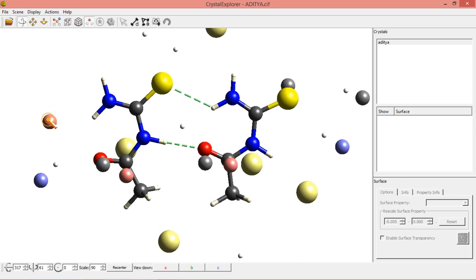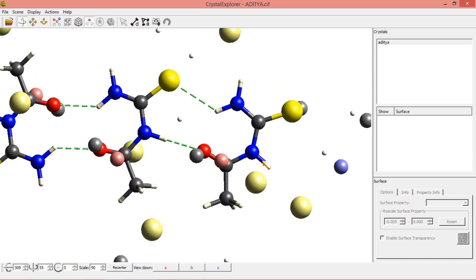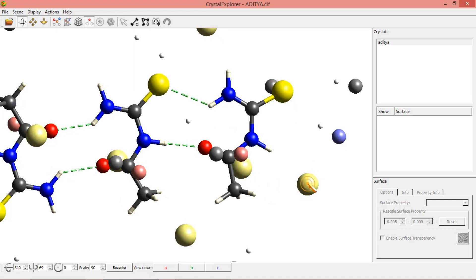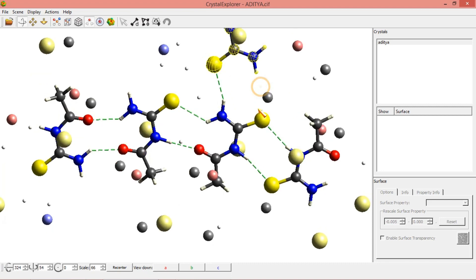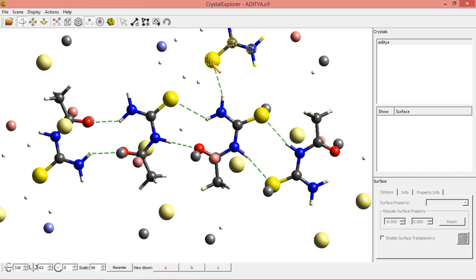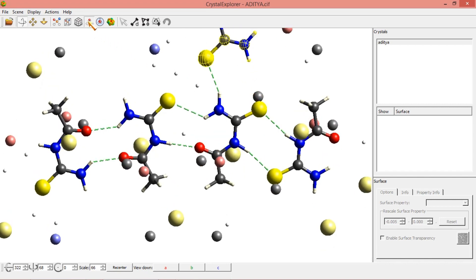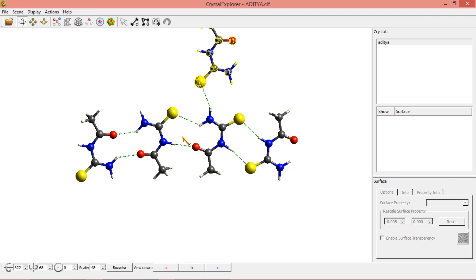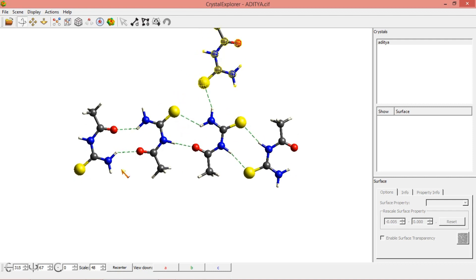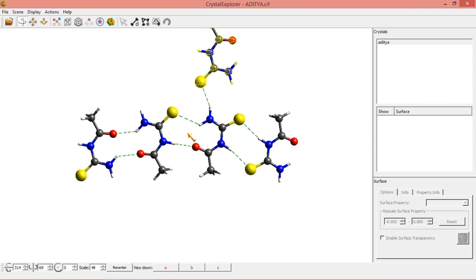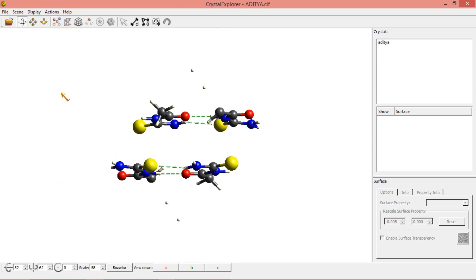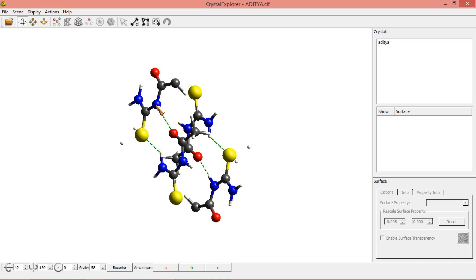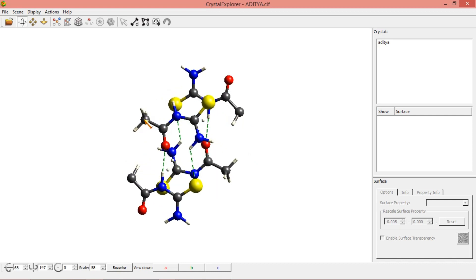I am clicking this one and here I have formed this. I am clicking the yellow color option. After clicking again, you can see only the intermolecular and intramolecular interactions. I want to see these in a unit cell. I am clicking this — in a unit cell, how many molecules are present which are forming the intramolecular interactions.